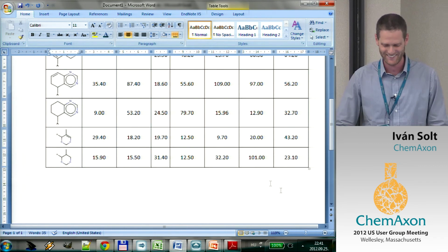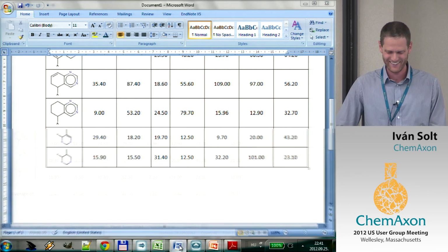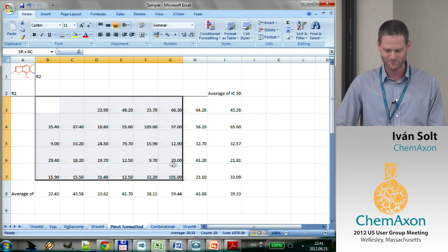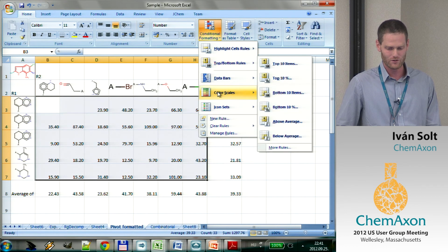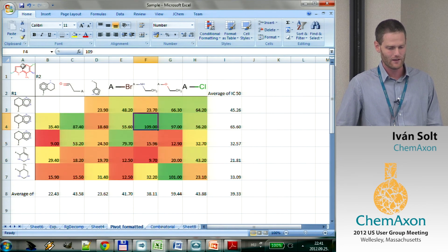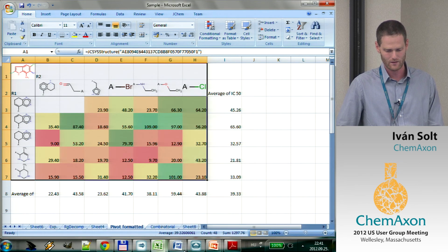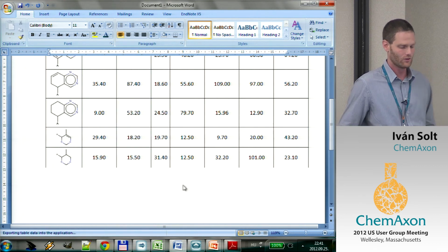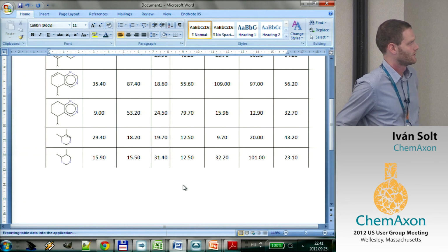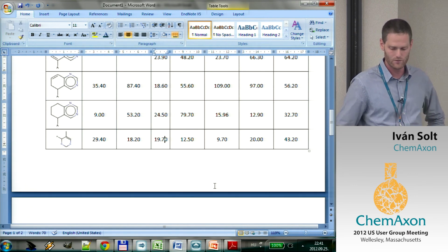I'm not done yet. There is more. I have 2 more minutes. And guess what? It's not trivial, actually. You can even conditional format this. And once again, if I go for it, this is another thing that is not trivial to transfer to Word. So in the original set, it wouldn't be transferred. There you go, it's all empty. The conditional formatting hasn't gone through.